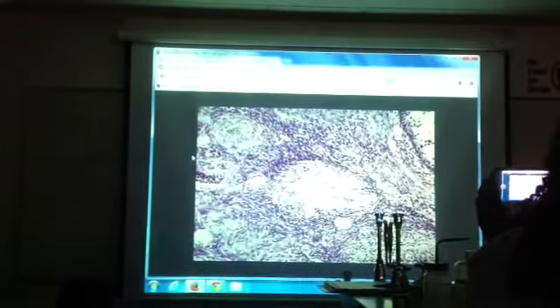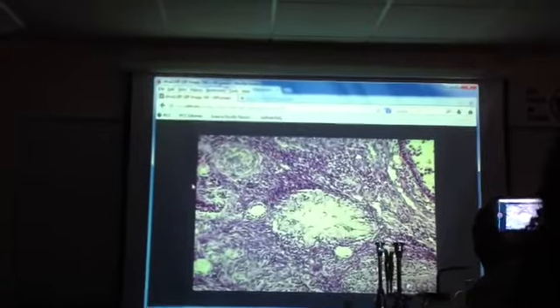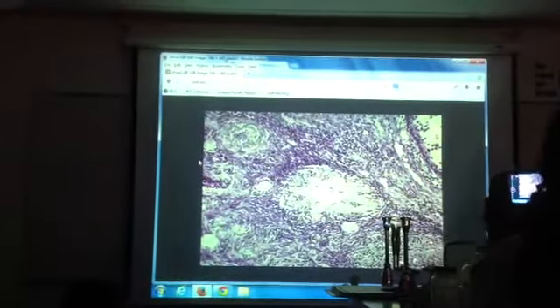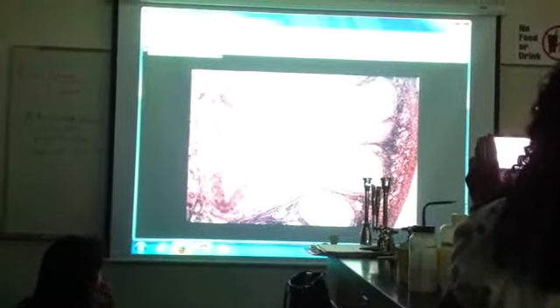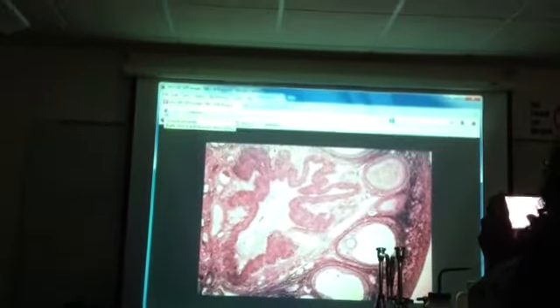So here's another albicans. Looks like a puffy cloud, but notice how small it is compared to the follicles. So that's just shriveling up and becoming a scar. So the luteum is usually big, the albicans is usually small. So look at the size again on that one. The luteum's bigger than all the follicles, right? It's huge. And the albicans would be smaller than the follicles.